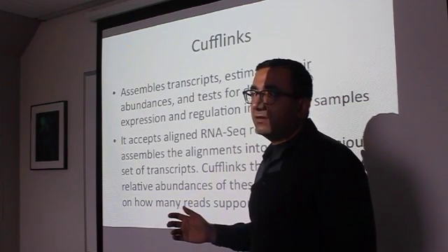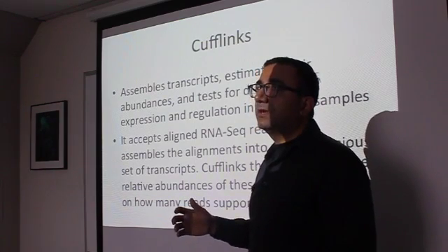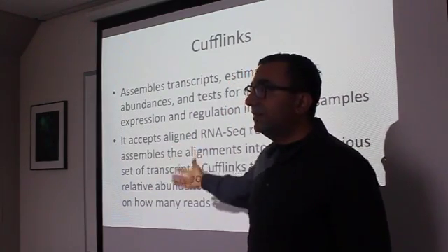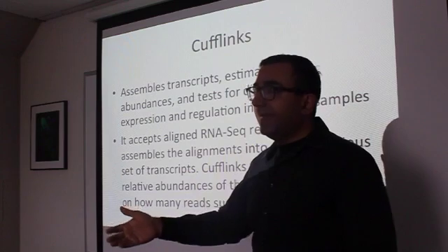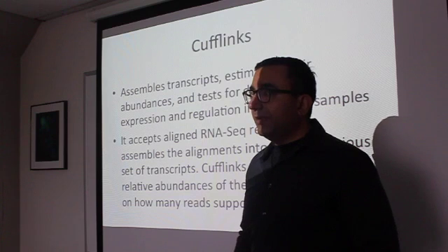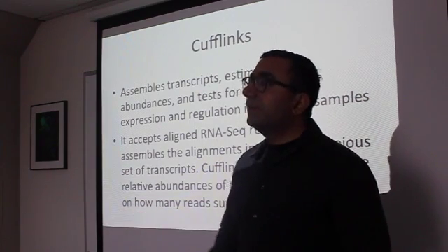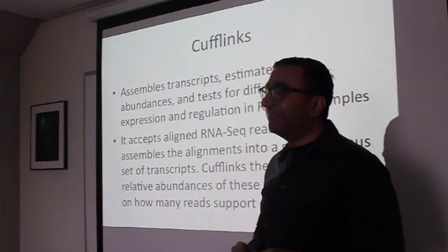The disadvantage is that the output does not look as promising as when you use other software, where you count your reads using separate software and do differential expression using other software. Yeah, I've seen huge differences between the way it's presented through Cufflinks and other algorithms. Really big differences. Right. So yes, I didn't say that you did. But that is true. He did it in multiple ways. Yes.